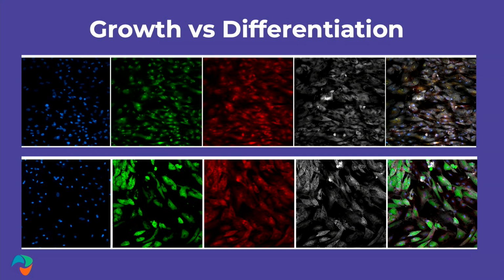So what you want to see here are the 4 channels. The first one shows you the DNA in the nucleus. The second one shows you the RNA. The third one shows you the skeleton, the cytoskeleton of the cell, which maintains the shape of the cell, helps it move and do a lot of cellular things. And the last one is the mitochondria and some other markers in there. And the last panel, you see lipid.